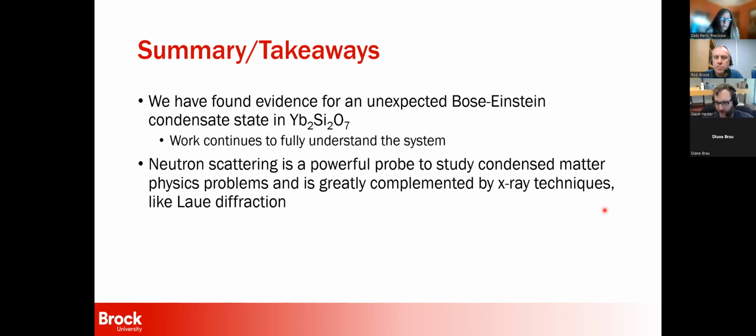Additionally, I love neutron scattering. It is one of the first things I started doing when I got into science as an undergraduate. And so I wanted to show that off a little bit and show that it is this powerful probe to study condensed matter physics problems, or really most physics problems, aside from things like particle physics and astrophysics. And it's greatly complemented by X-ray techniques like Laue diffraction.